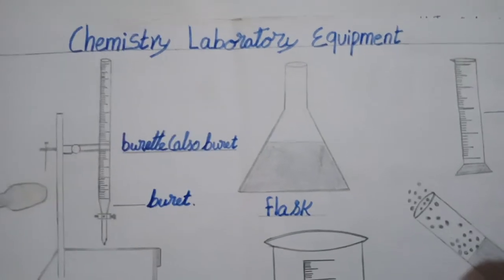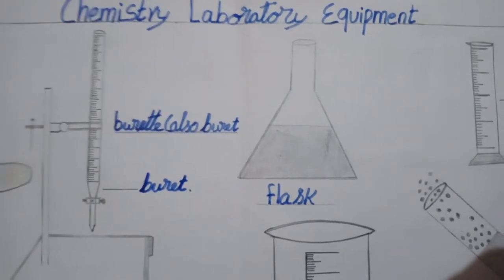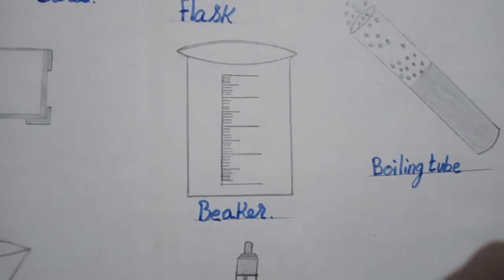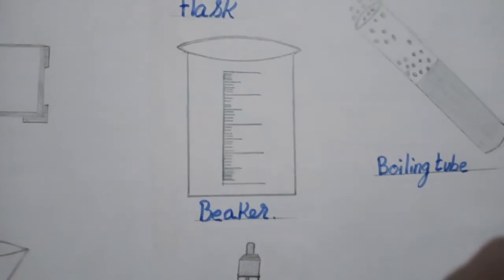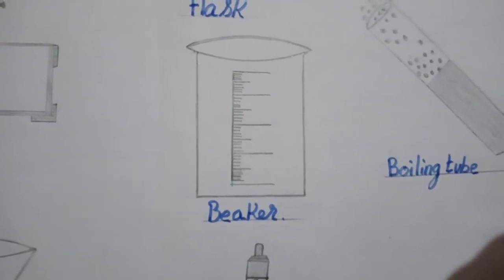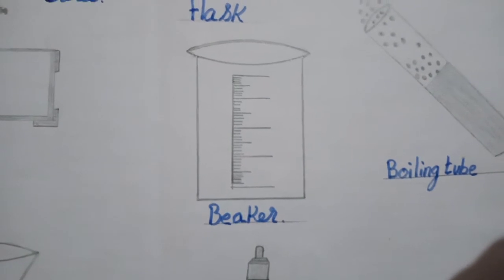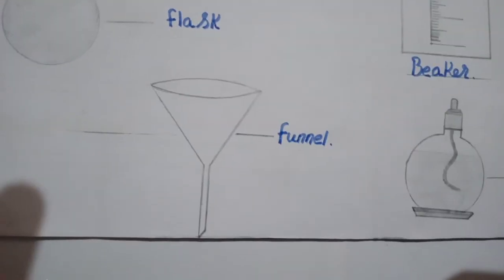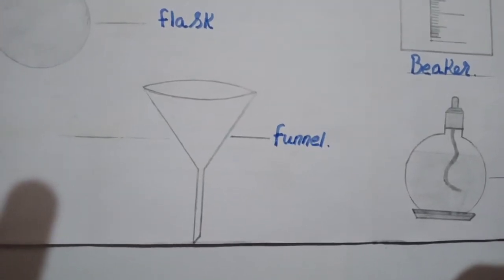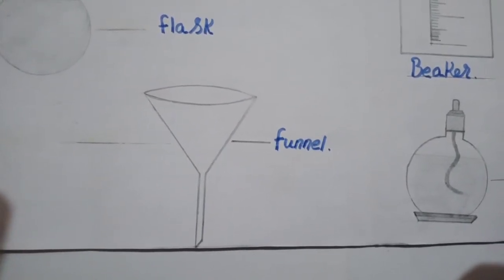Next one is a flask — this flask is a normal flask and it is used to heat with chemicals. Next one is a beaker. This beaker is used to measure the amount of chemical with salt and to heat it.